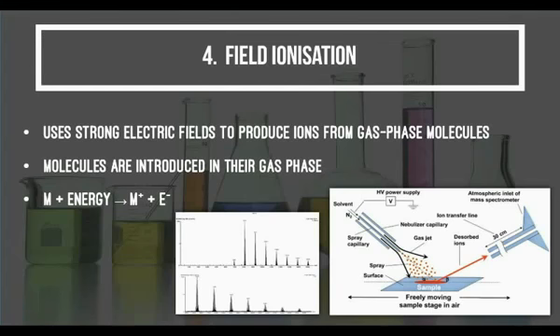Field ionization produces molecular ions from most organic compounds. When a complex mixture is analyzed by this technique, we obtain a single peak for each constituent or for a group of constituents that shares the same nominal molecular weight. By repeated scanning, we can obtain a quantitative molecular weight profile of complex mixtures. The results are then presented in the form of a spectrum as shown in the first figure. An example of field ionization can also be seen from the second diagram inserted, showing the process of electrospray ionization.